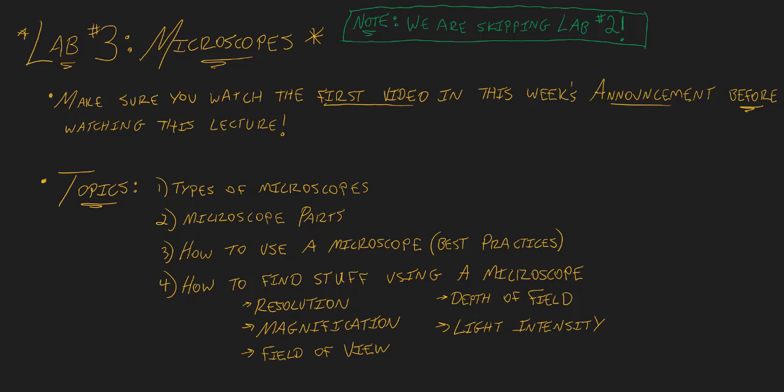Then she's going to talk you through the various microscope parts. She's going to talk you through how to use a microscope, what your best practices are, meaning if we were in the lab, what would be the correct way, the most appropriate way to handle the microscope as a tool. And then the latter half of the video talks about how to find stuff using a microscope.